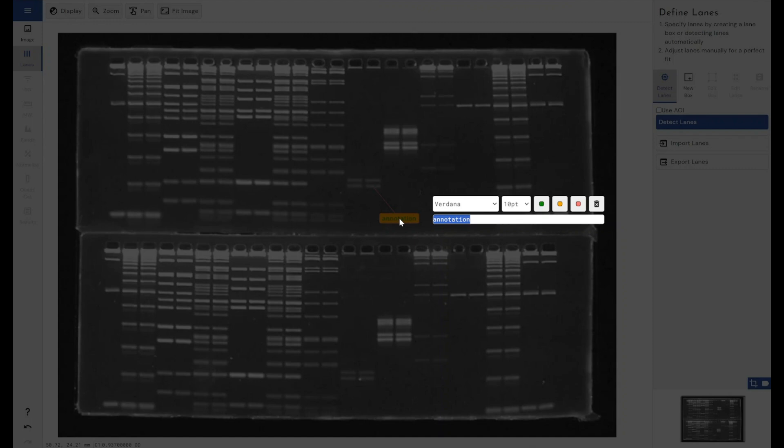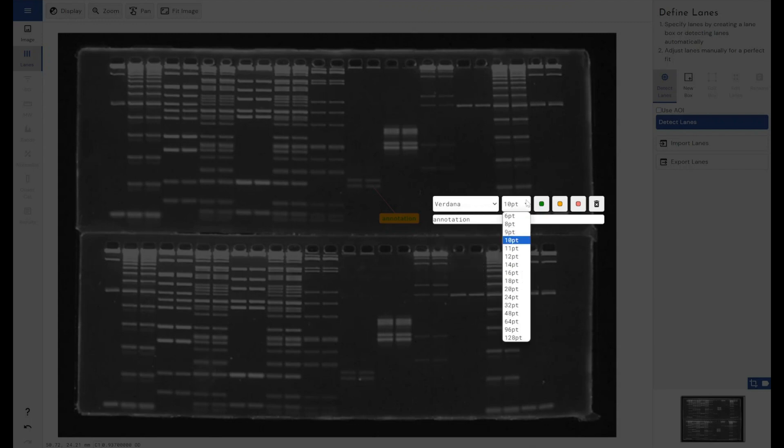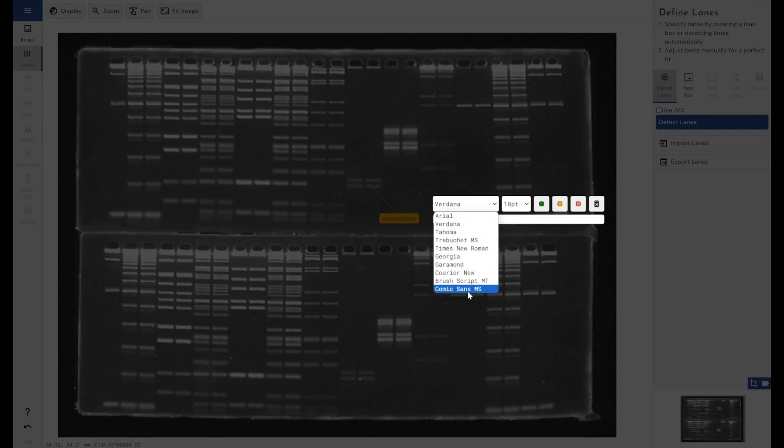Once we're in the edit mode, you can see that we've got a few different basic editing functions. We've got the ability to change the font. We've got a number of built-in Windows fonts here. And what we can do is change the size of those fonts based on normal point. We can choose any font that we want from the built-in Windows fonts.